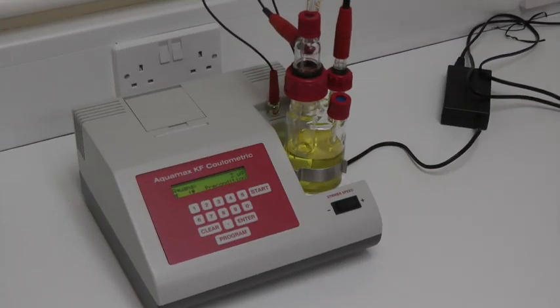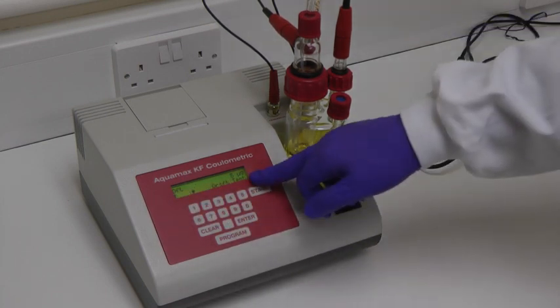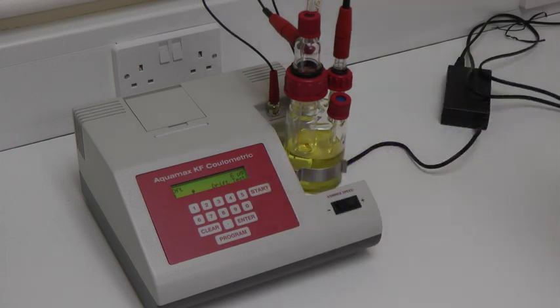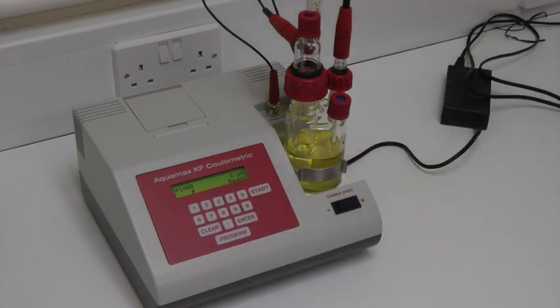After preconditioning is complete, the Aquamax KF moisture meter will monitor the background drift, and then move into the ready mode once this is stable. Once in ready mode, the keypad is enabled, and the instrument can be programmed.